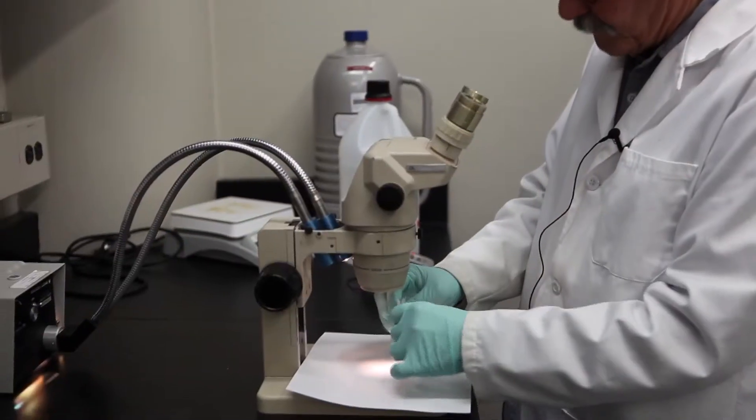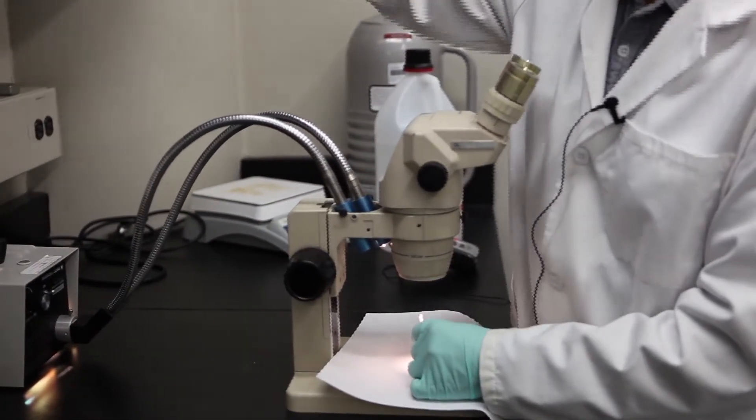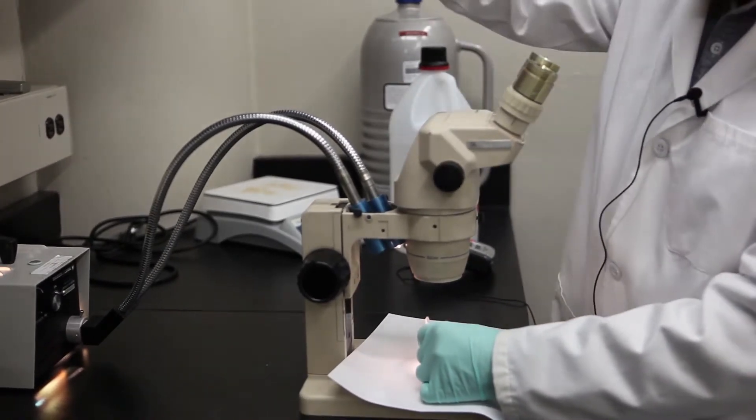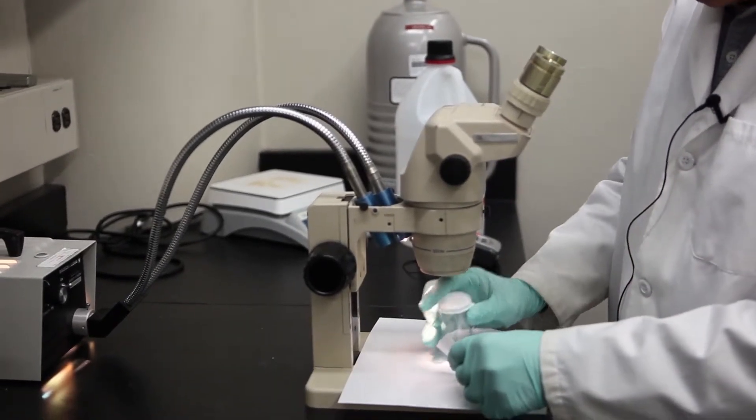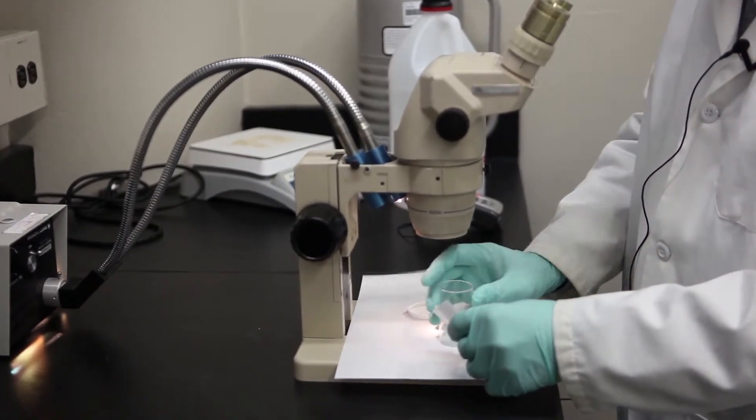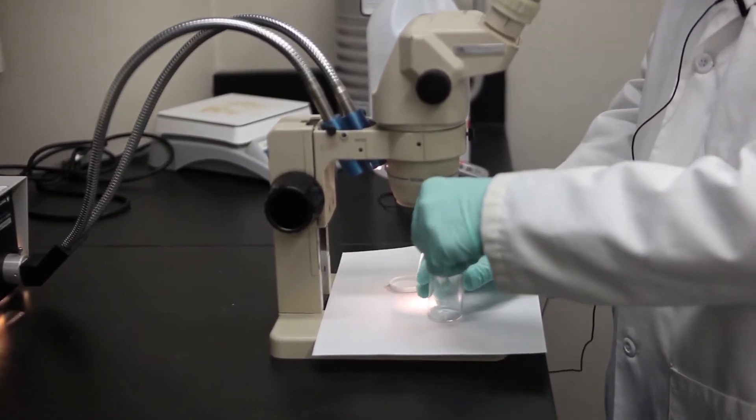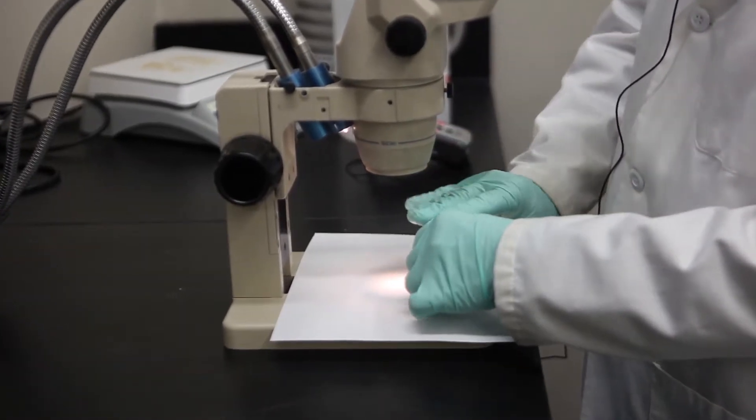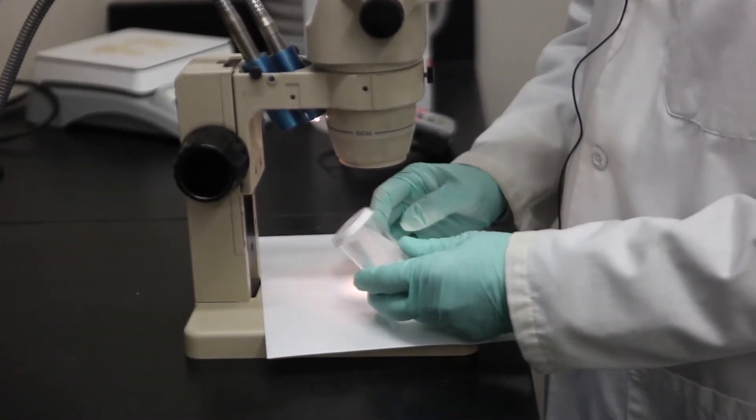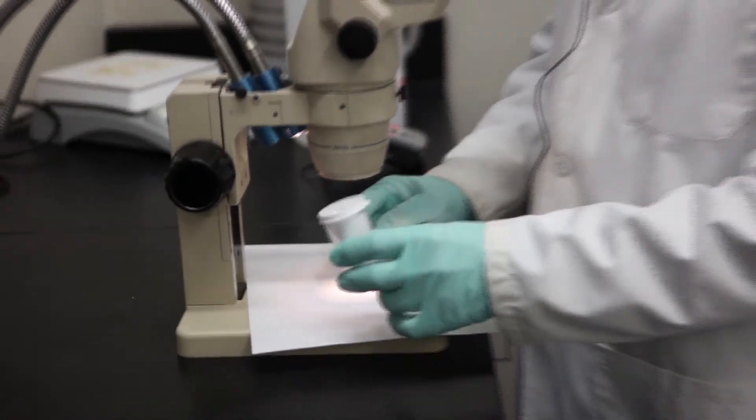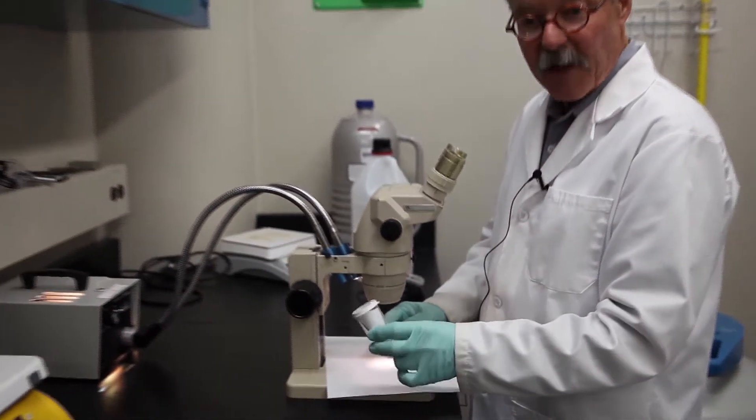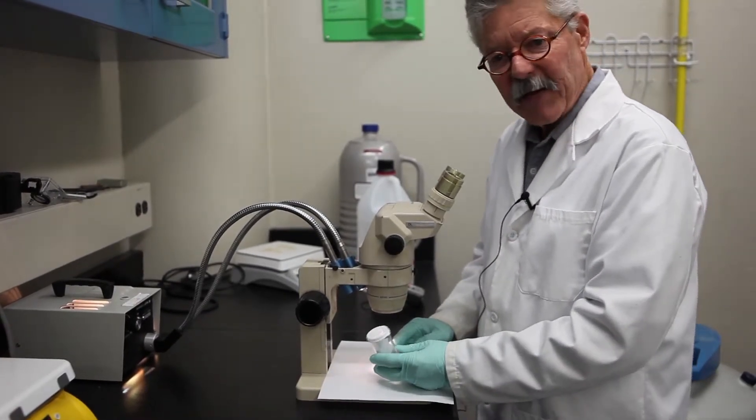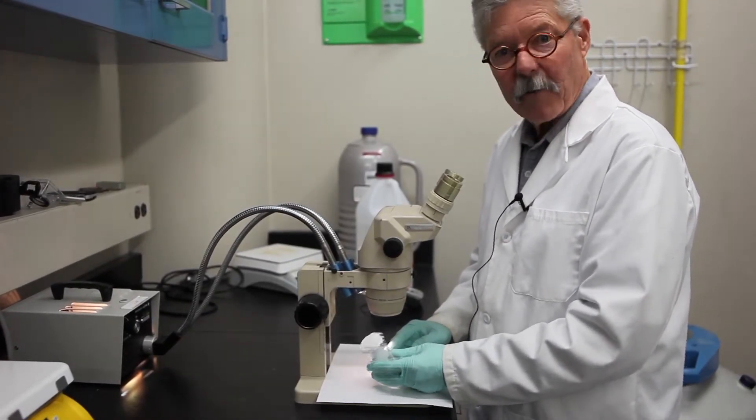So at this point in time, we are now going to put the sample into a snap cap vial so that it's contained. And then we are going to properly make notation on the vial, so that everybody knows what procedures have been performed on this sample. And then it will go up to our upstairs picking room, where it will be prepared for mounting.